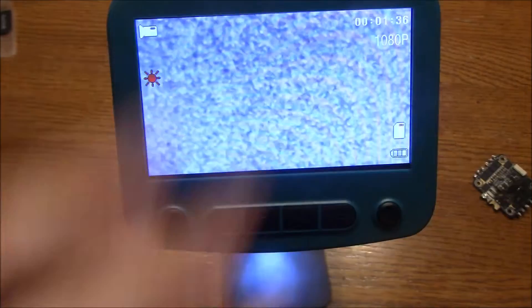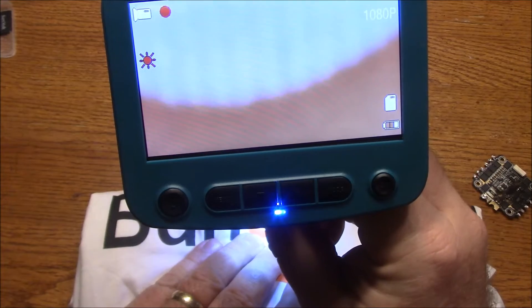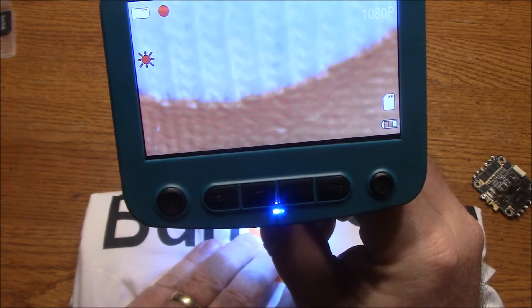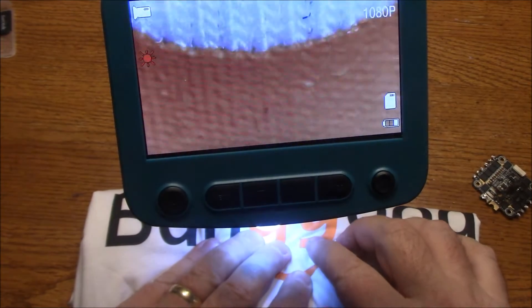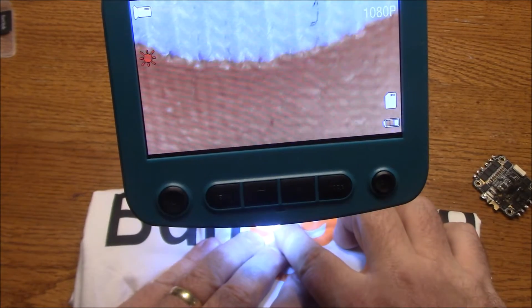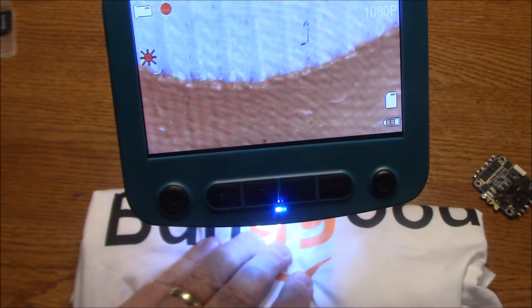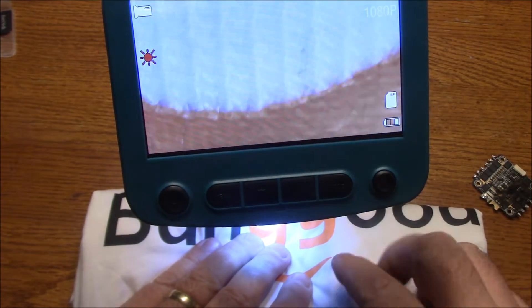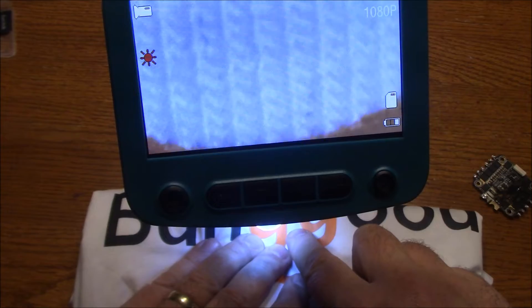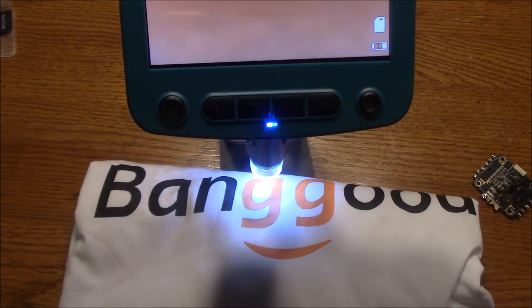One more thing — I also have this Banggood shirt. I'll see if I can get it under here and look at some of the threads just to see what it can do. You can see it's not an iron-on — this thing is actually put on here and it's made with just the normal stuff you make shirts out of, which is kind of cool. You can see all the patterns inside the cloth, which is really neat.